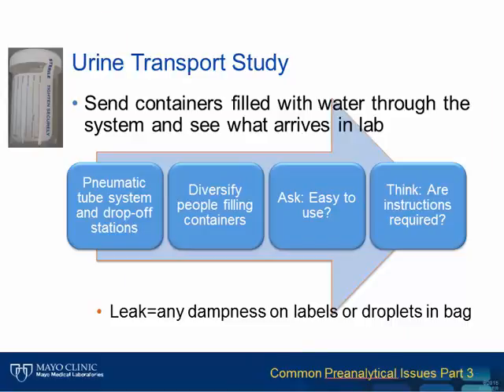Next, we collected data in a transport study. We attempted to mimic the existing process as much as possible. We asked multiple different people to help fill the container with water and close it to be packaged and sent via one of the number of different pneumatic tube or drop-off stations.